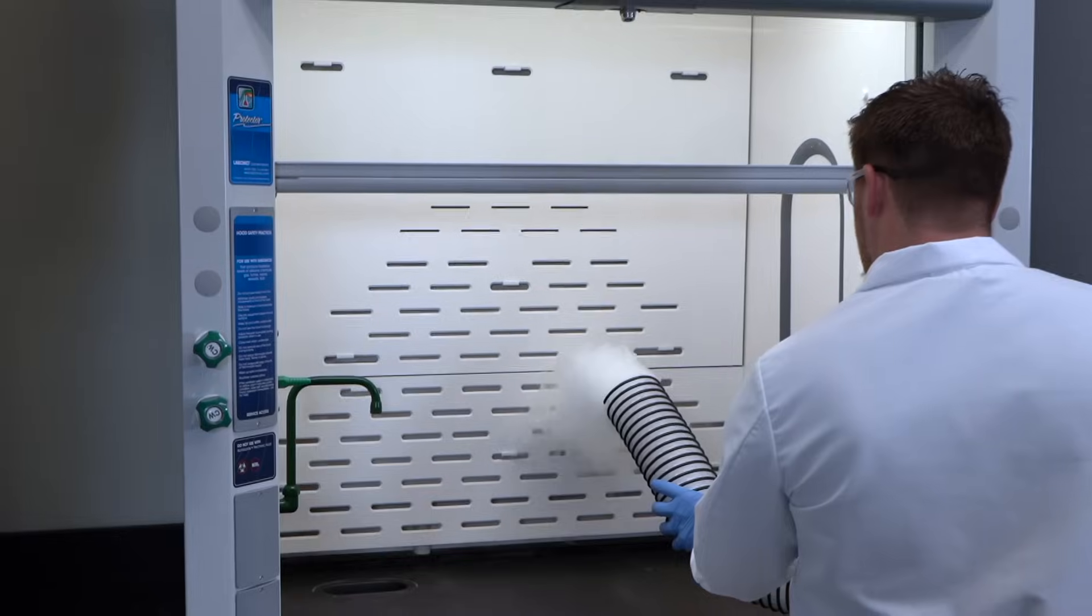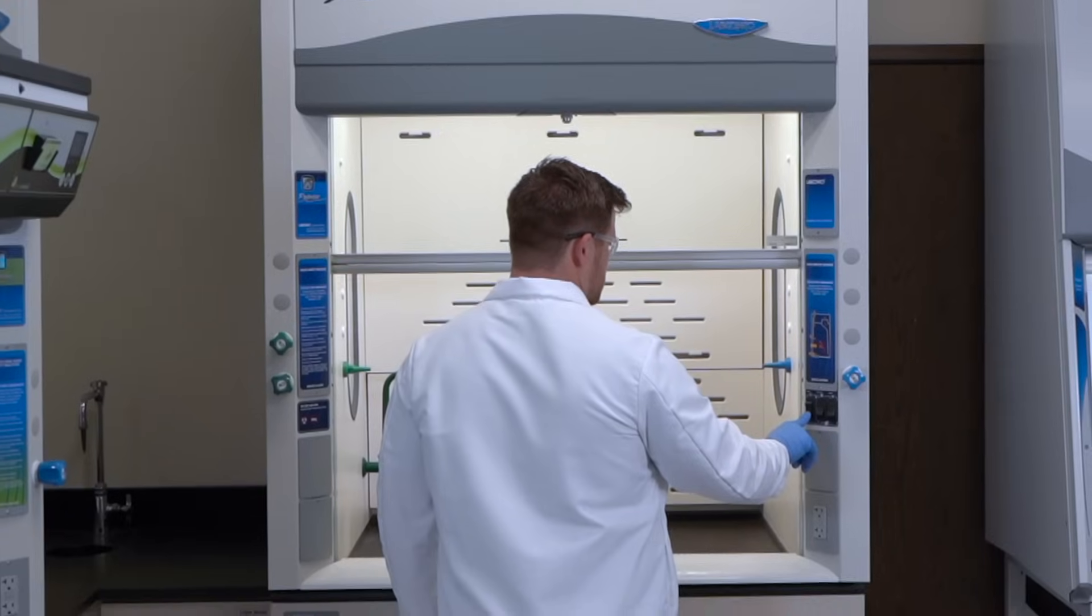Aerodynamically designed components such as the sash foil, vertical fascia baffle, and liner enhance the hood's ability to capture fumes.